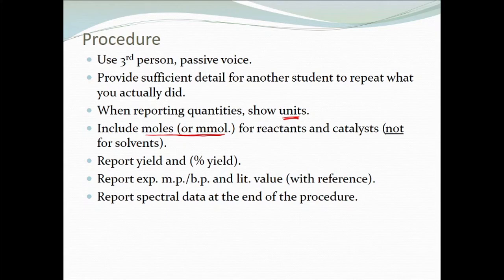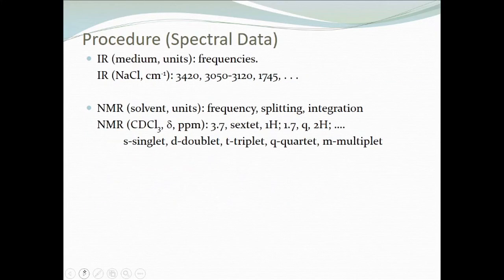And always report spectral data at the end of the procedure. And you've seen this before as well. For IR, we identify the medium on which we obtained it, typically as salt plates of sodium chloride, the units, and then the frequencies of the various peaks. If it is a single peak, you give a single frequency regardless of how broad it is. If there are multiple peaks of the same type, you would give a range.